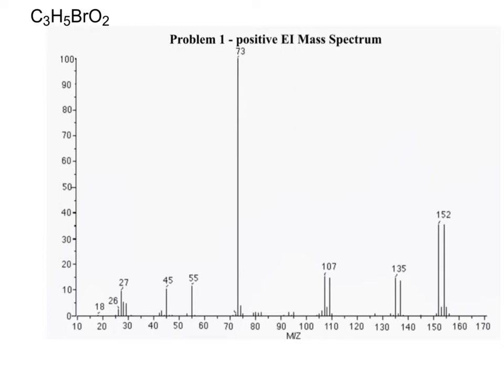In the lab, a molecule is bombarded with electrons, which causes it to fragment off into charged particles. These charged particles are then grouped according to mass and abundance, which is what is represented by the X and Y axes respectively. That's why a mass spec graph is a great place to start, as it gives you an idea of what the structural formula is, as well as what particles are most abundant.